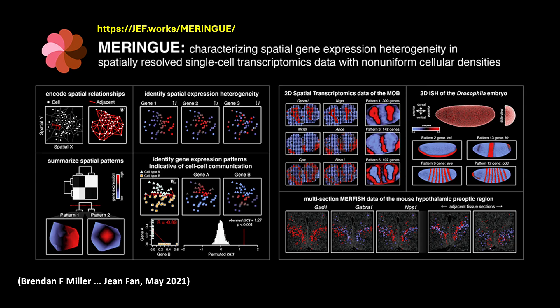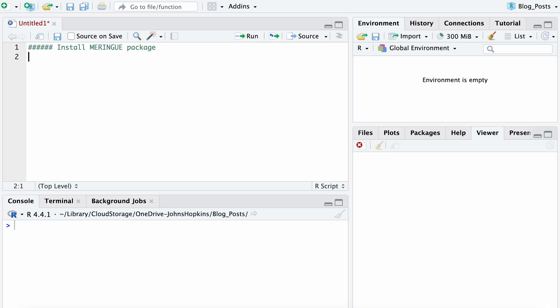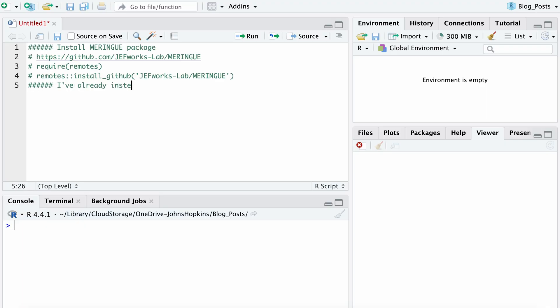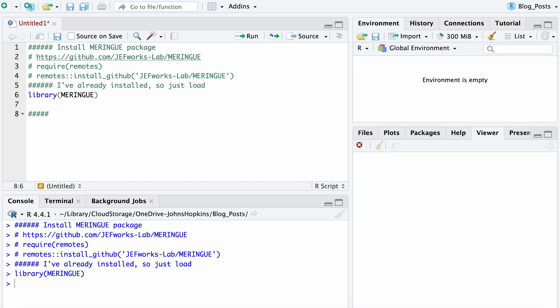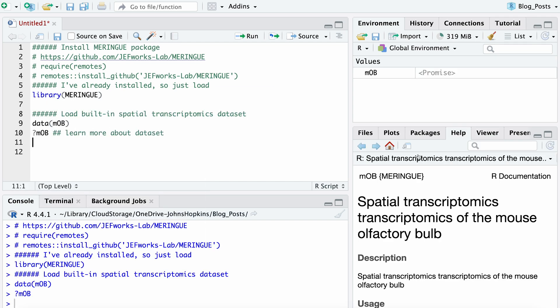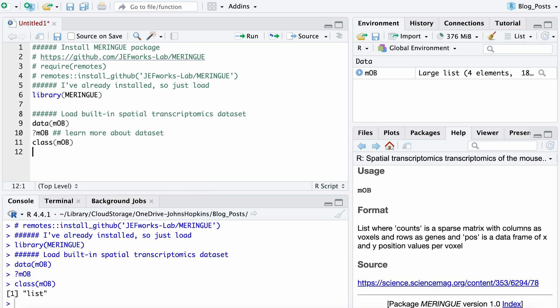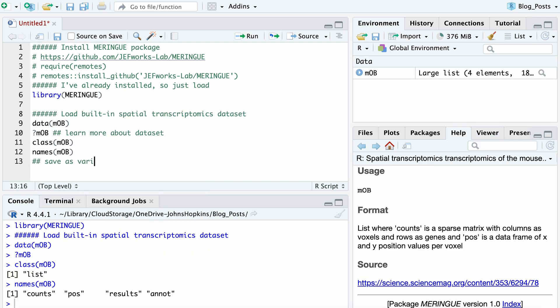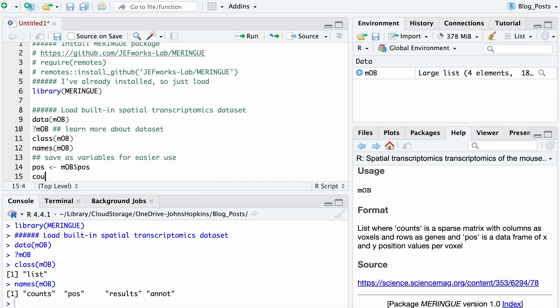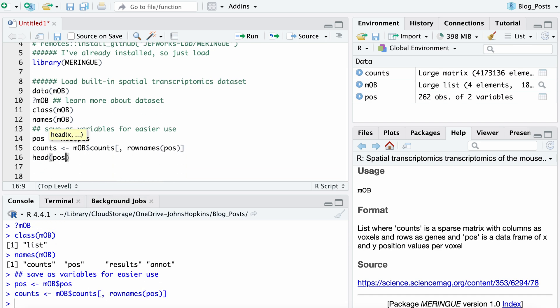To more easily evaluate Moran's I for spatial transcriptomics data, we developed an R package called Meringue. Let's have a hands-on demonstration of how to use Meringue to apply Moran's I to rank spatially variable genes in a spatial transcriptomics dataset of the mouse olfactory bulb.